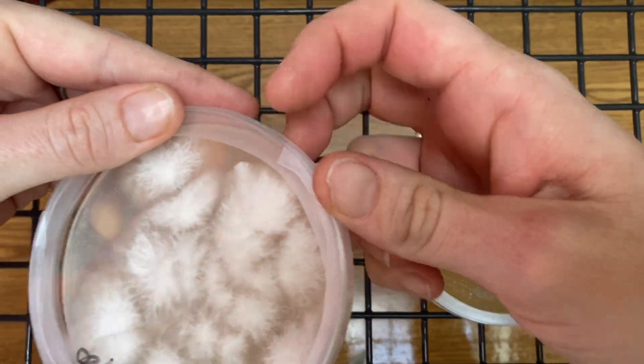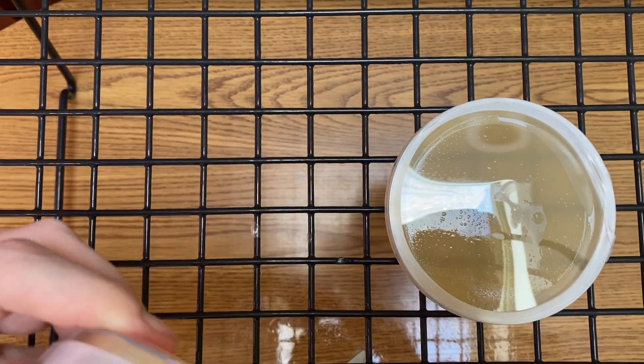Hi, Ashley here, and today I'm going to show you how to transfer rhizomorphic mycelium.